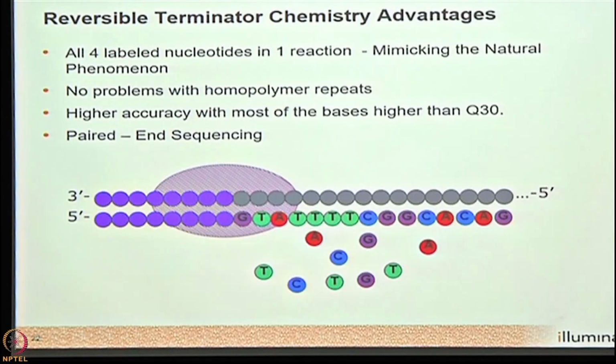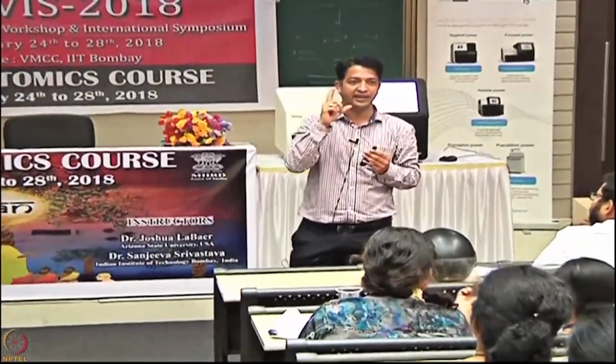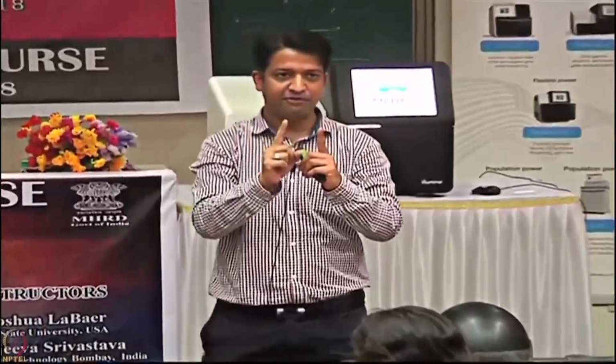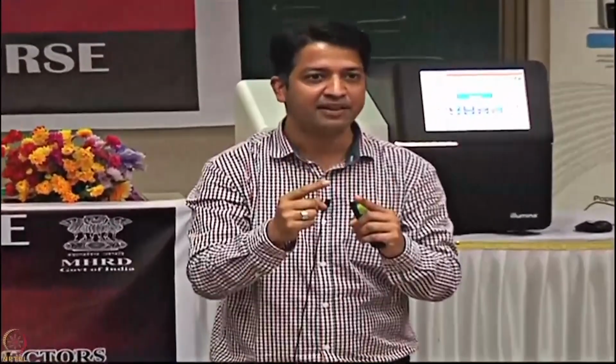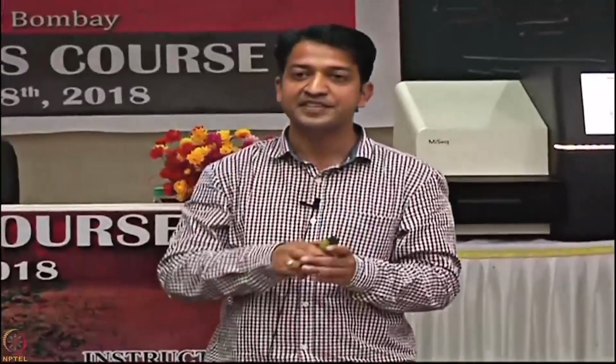be the hurdle there? If one base is added, let's say there is one call for A in a cycle, the signal will be one, and if two A are added, the signal will be double. But if you have multiple A or multiple G over there, you can't resolve the signal. So in terms of NGS, in Sanger, how do you detect the quality of the data?